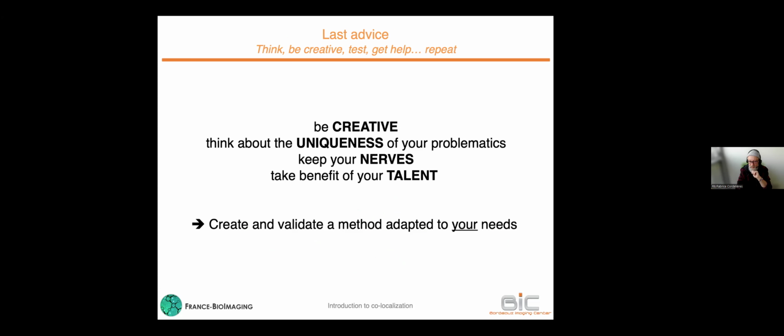So, important message. When working on colocalization, have a look at the published methods, of course. But if you don't find an appropriate method, do not hesitate to be creative. Think about the uniqueness of your problematics. Keep your nerves, because sometimes colocalization might be tricky, and take benefit of your talent and imagination. Create your method, adapt it to your needs, and publish it.